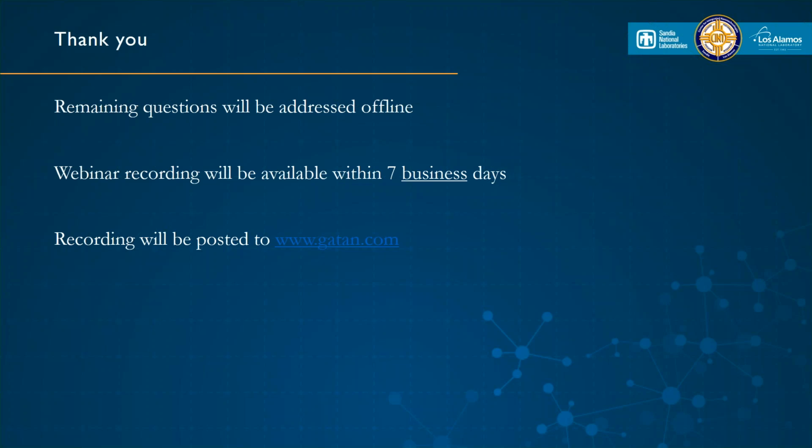And that's really nice for us as a user facility too, to have that kind of thing built in, because we can be a bit more confident that the camera will take care of itself, and that perhaps some more inexperienced users can't do lasting damage. Yeah, great.